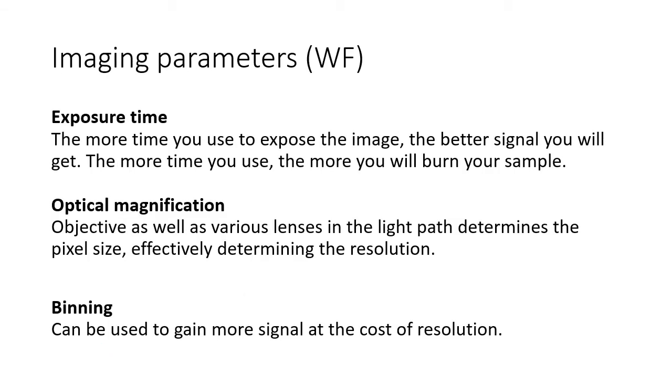Next, we will discuss the most important imaging parameters of wide field imaging. First we have exposure time, which basically tells you how long you put light into the sample. The more light you put in the sample, the better images you will get, as long as you are not overexposing or burning your sample.